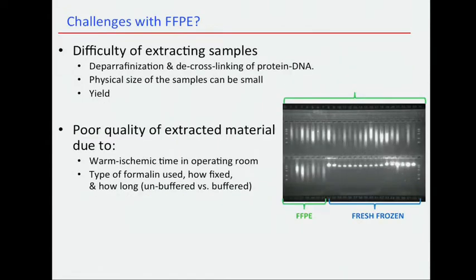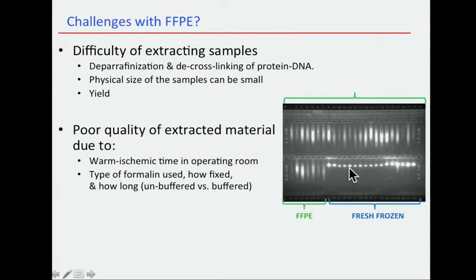So there are challenges working with FFPE. It's difficult to extract from the samples — you need to de-paraffinize them and de-crosslink the protein and DNA. The physical size of the samples within the paraffin block is sometimes small, and the yield of the DNA you can generate out of them is problematic. There's clearly poor quality of the DNA that comes out of it, as you can see from these smeared gel runs — the FFPE DNA fragments are broken compared to fresh frozen.